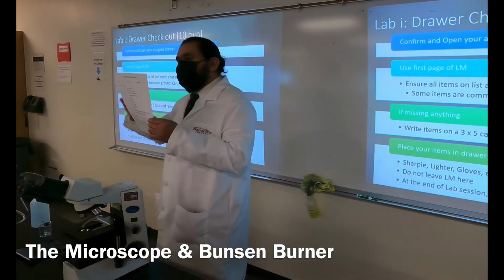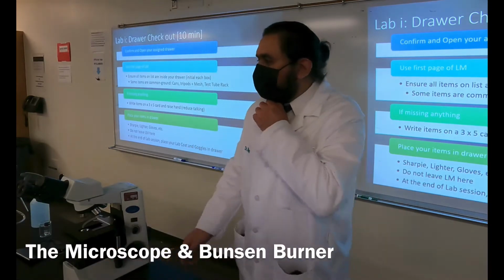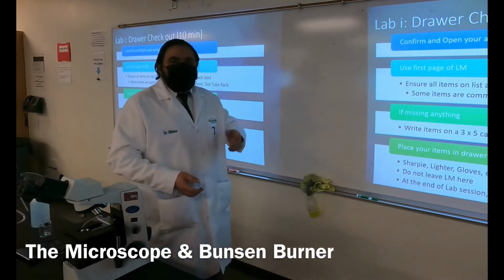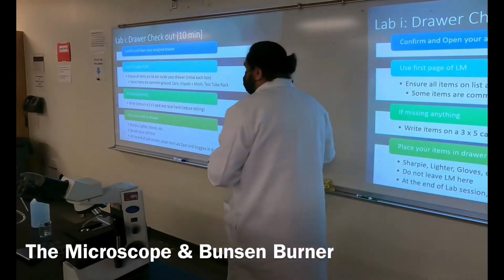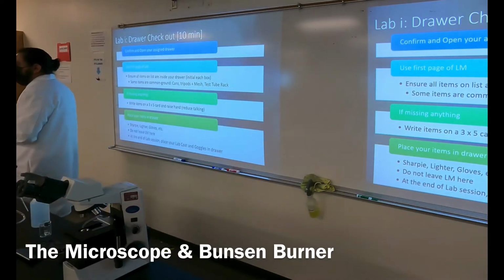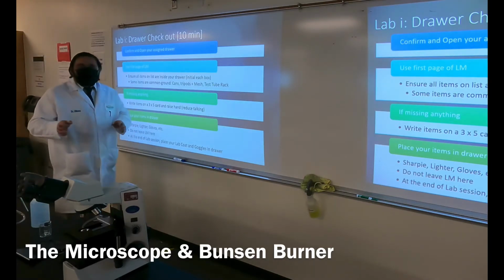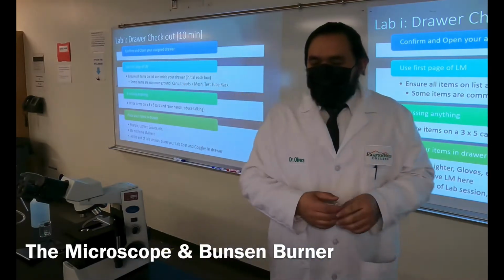Okay, now from the top, let me give you a quick heads up. During remote times or during hybrid times, that kind of thing, some of these items may be shared. So for example, the test tube rack is probably in front of you already, just sitting on top. The cans, like the soup can and the coffee can, are probably up there already sitting in front of you too, so it's not in your drawer. This also applies to the wire mesh and the tripod, which we'll demonstrate a little bit later. So those will be there. So don't worry about them too much. They're already up there, nothing to be concerned about.